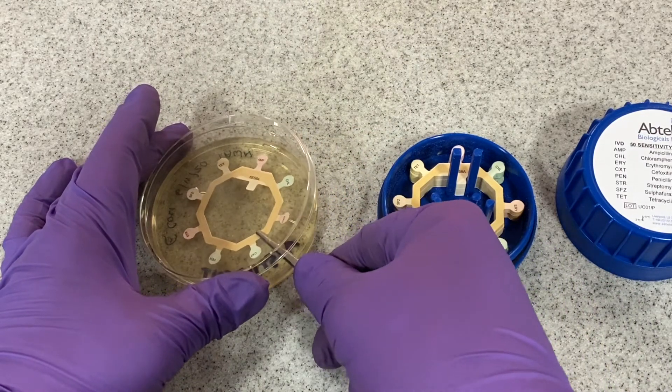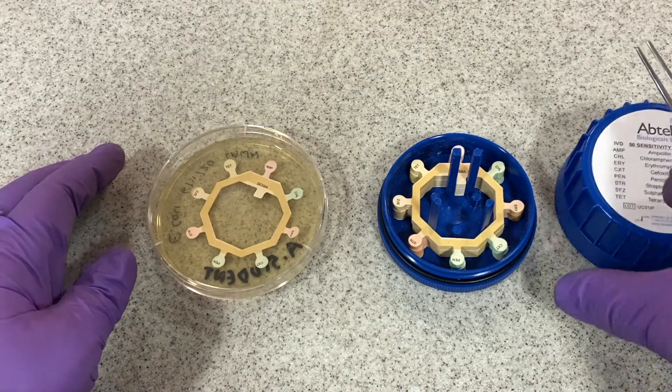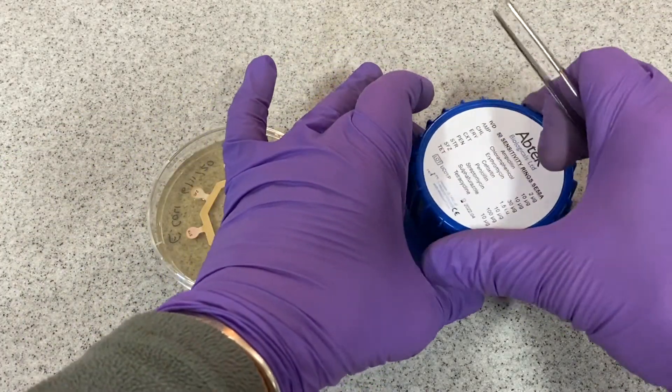The antibiotic ring is placed into the petri dish by moving the lid of the petri dish slightly upward without removing it.